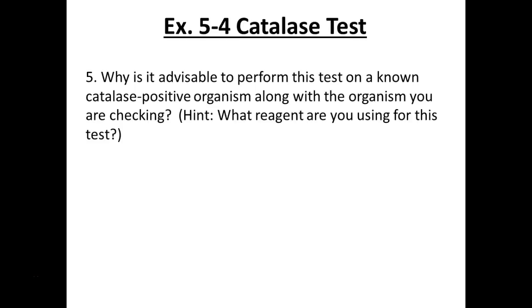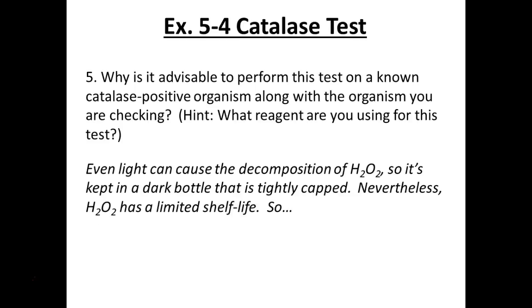There's also an old wives' tale, if you pour hydrogen peroxide on a wound and it doesn't bubble, right? It's not infected. No, you just poured water on yourself. It should always bubble because, remember, you are catalase positive, right? Your cells should break it down, whether the bacteria are there or not. So we want to make sure our reagent is fresh. Actually the stuff I had the other day was old, and so I dumped it and got new stuff. So we get nice fresh stuff. It's already been tested. It's going to bubble like crazy.